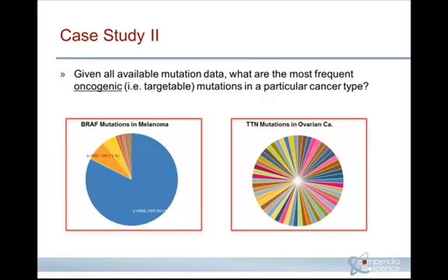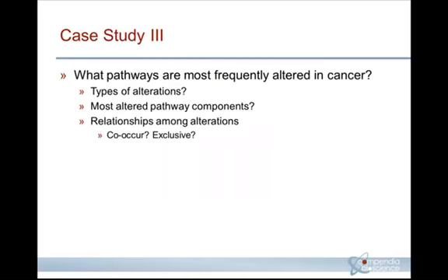Okay, so case study number 3 really focuses on pathway analysis and integrative analysis of cancer genomic data, very much in the spirit of the Cancer Genome Atlas publications. We're trying to replicate the ability to run these analyses, but in a systematic, pre-computed fashion on the web.